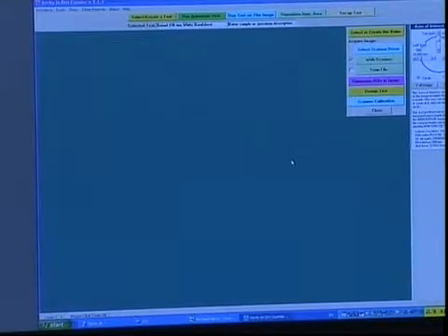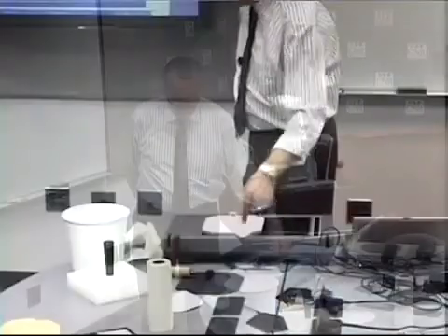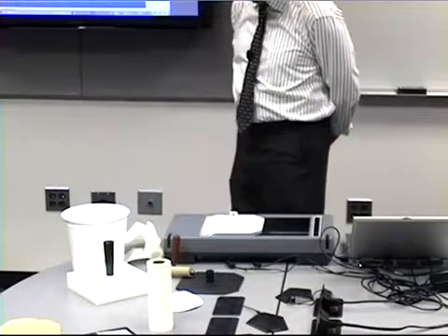And as a result, when we go back and push the run automatic test, it will go through and make the test automatically. Just clicking, it goes and does everything on its own. It reproduces exactly every step along the way, including the threshold and the offset calculation and the scan. You can see perhaps the scanner head moving down. And maybe, I don't know whether you can see the two bulbs, but I can see the two bulbs in the scanner head.